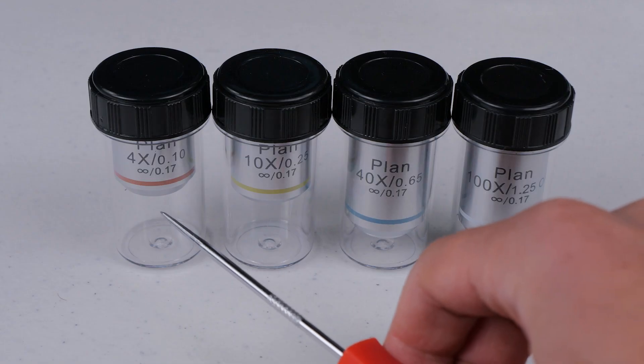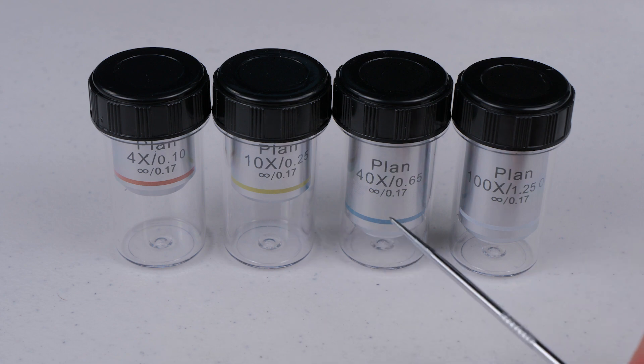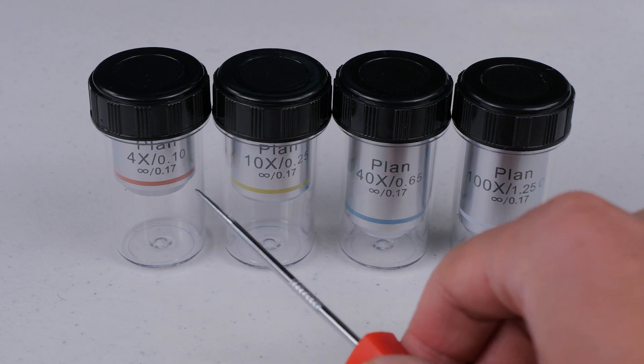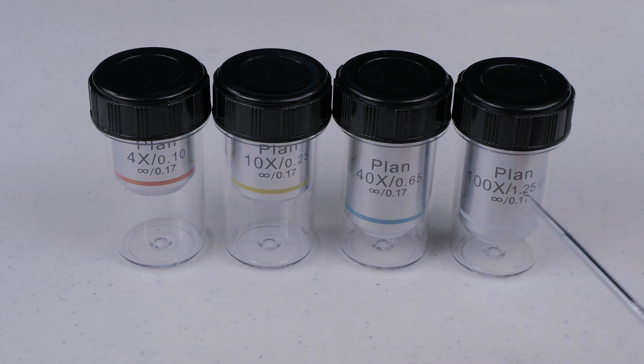A general trend that you're going to find is the higher in magnification that your objective goes, the numerical aperture also correspondingly gets larger and larger.